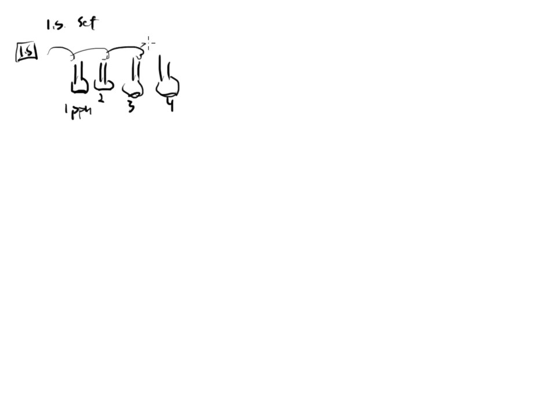And I've created an internal standard set. So I've got 4 volumetric flasks, 1, 2, 3, and 4. And I'm just going to make this easy. It's going to be a 1 part per million, a 2, a 3, and a 4 part per million. And then the internal standard has gone into each flask. And remember, it's the same amount for every single one.